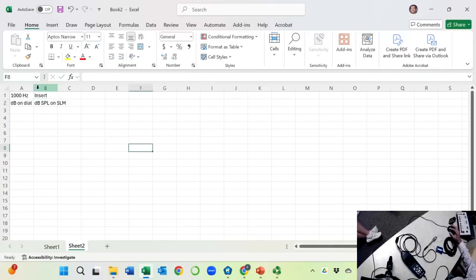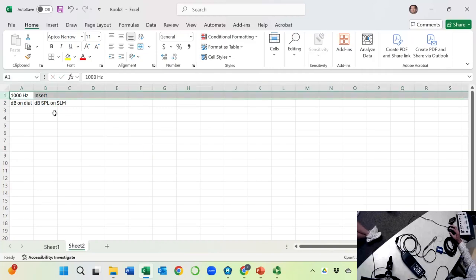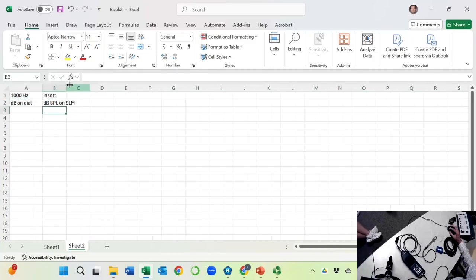Okay, I probably don't need the first line. It's okay, defaults are smart enough.